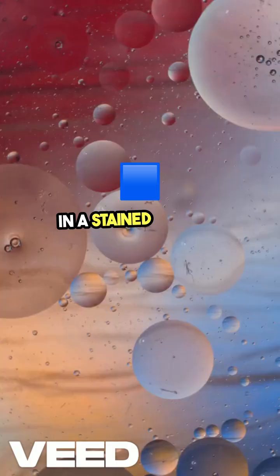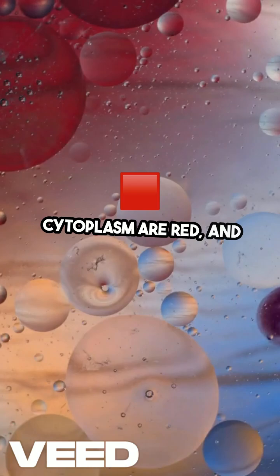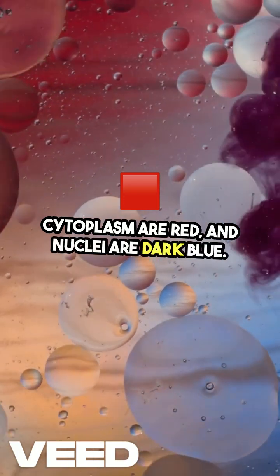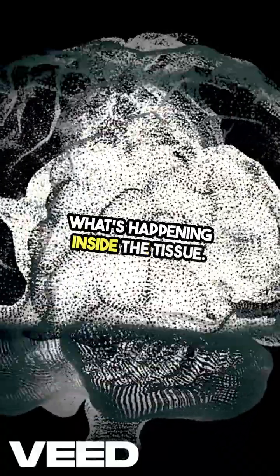In a stained section, collagen appears blue, muscle and cytoplasm are red, and nuclei are dark blue — a clear visual map of what's happening inside the tissue.